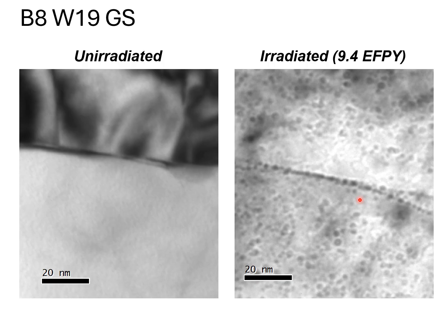So you have to have your optic axis correct, and you have to have your stigmators correct, and then you can see the evidence, because you won't be able to see this unless the microscope is set up for high resolution imaging.